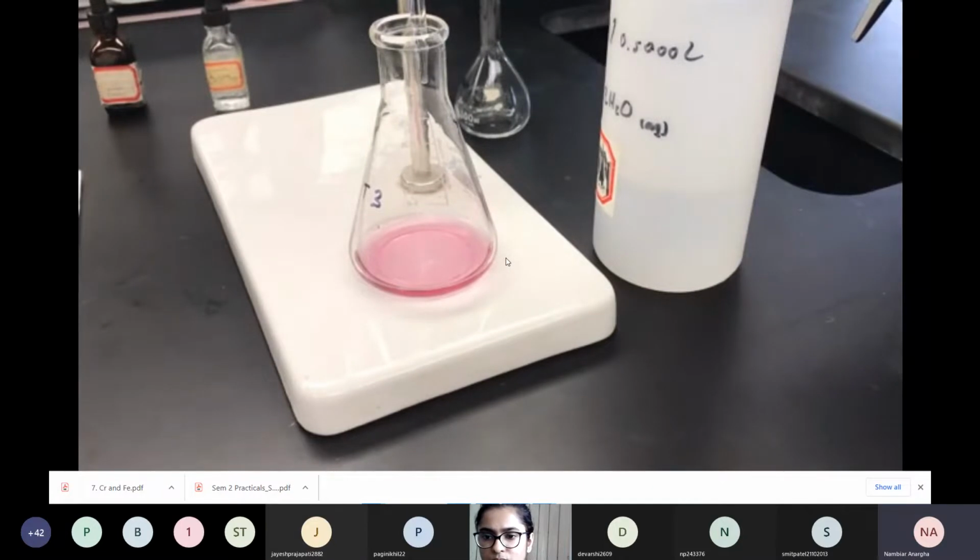The nice thing about this is that we can add the titrant pretty quickly. Initially, I found that in the last titration that I did, I added about 15 and change milliliters to this. So I'm using a little bit bigger volume this time, so I know I can put about 15 milliliters of titrant in pretty quickly and then sneak up on the endpoint.